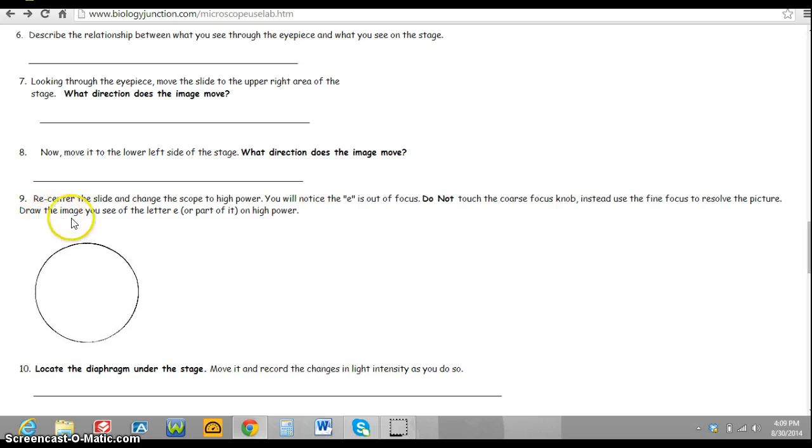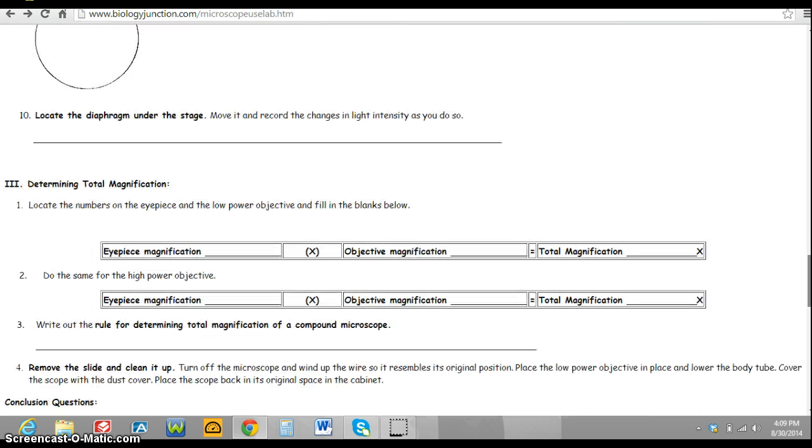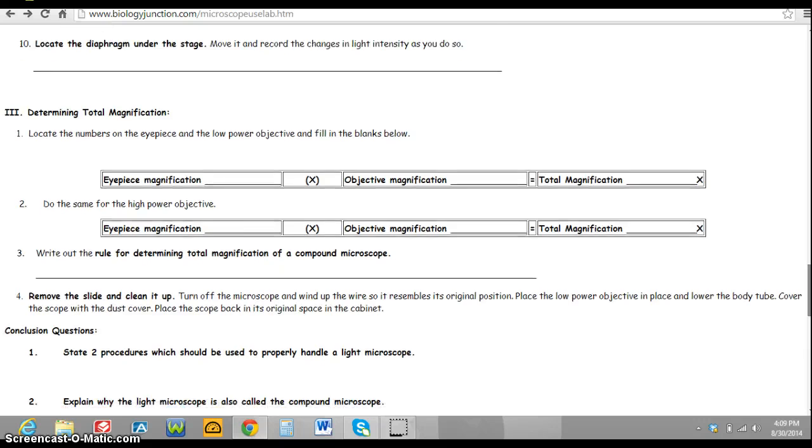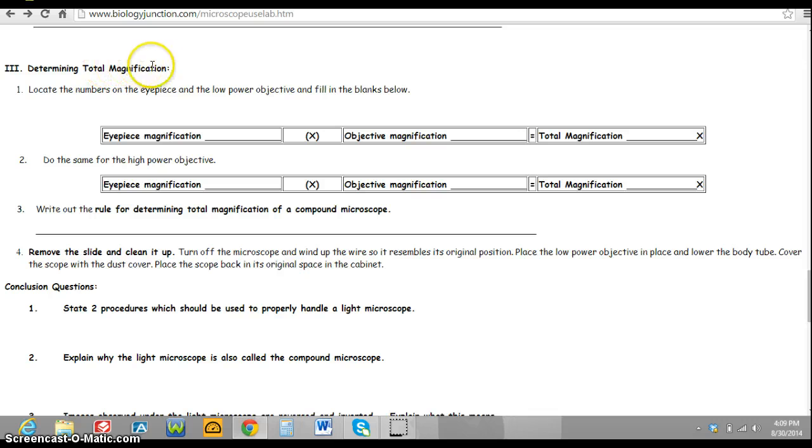Then it says that you will need to change it to high power, and again you will need the circle to draw the image that you see.